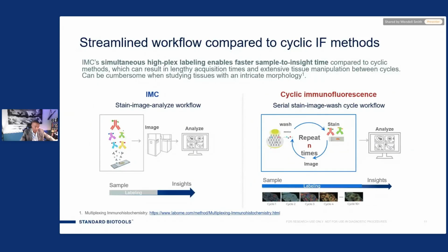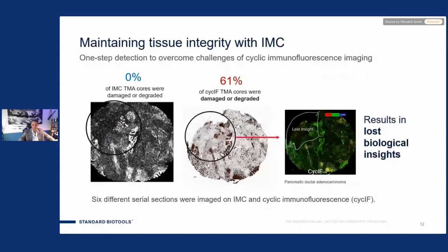And so how others have developed a strategy to get around that autofluorescence is to limit the number of targets, to maybe staining the entire panel of antibodies, but then using secondaries 2 or 3 at a time and doing a cyclic approach to build upon those fluorophores that you're using over and over and over, and then overlaying those images together. That strategy employs potentially more time, more cost, and certainly with extra rounds, you will see some level of damage.